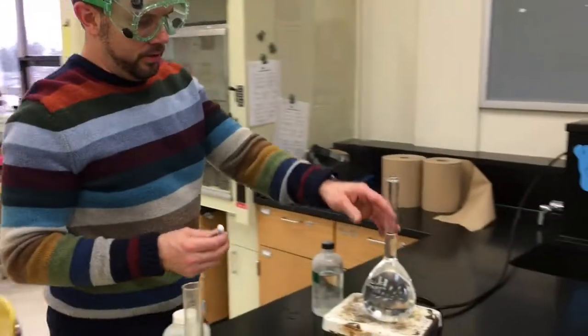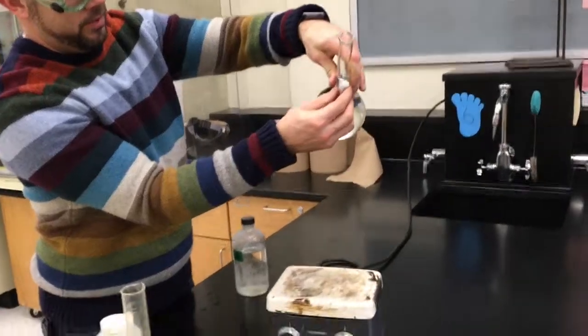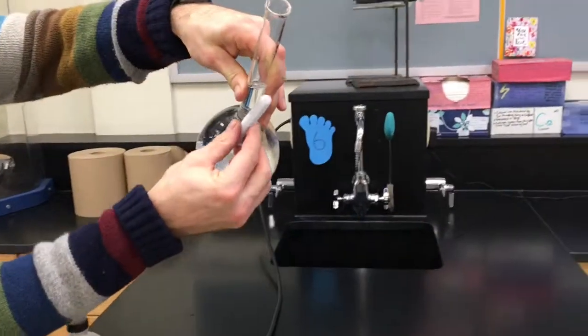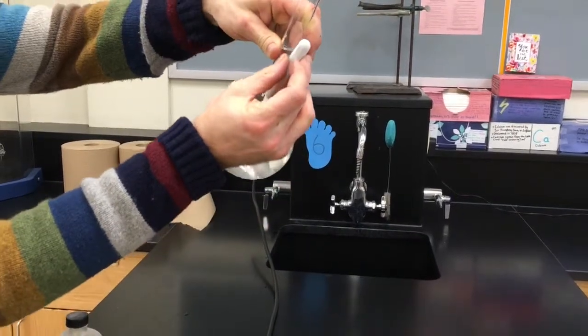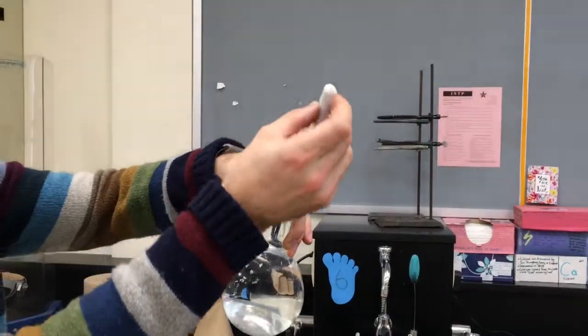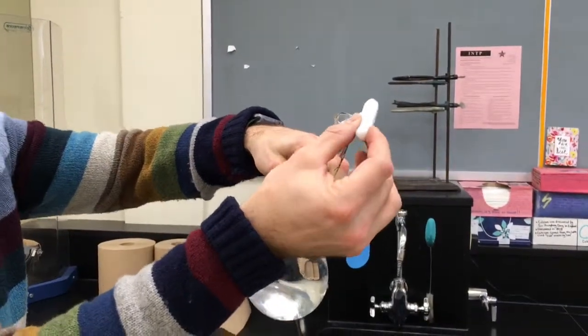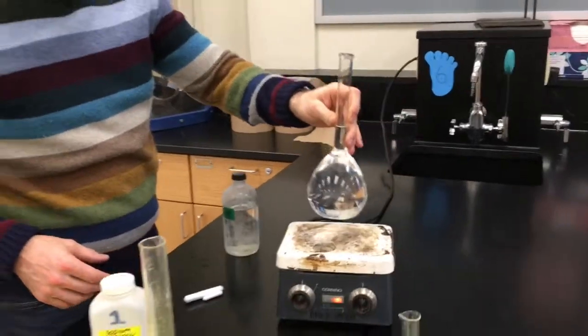Meanwhile, to get that magnet out, you never want to pour the magnet down the drain or whatever. You just get a bigger magnet. Kind of, well, maybe. This is where that luck comes in. Not today. Yep, maybe today. There we go. And then the big magnet's out. Now I want to rinse that off. Obviously, I don't want that.